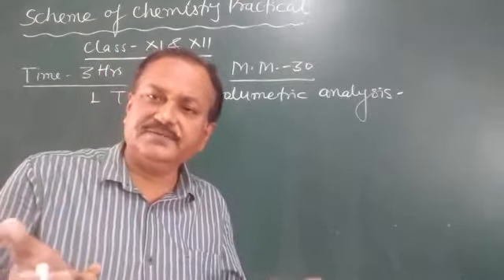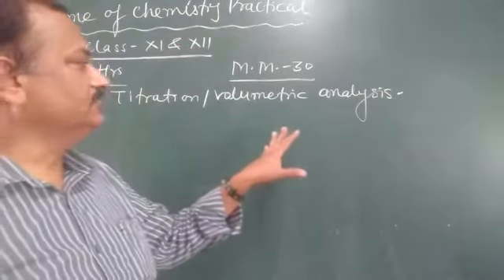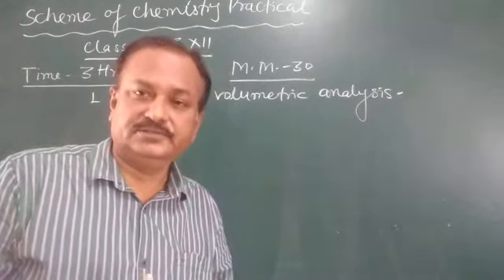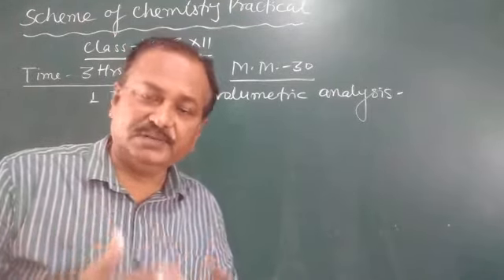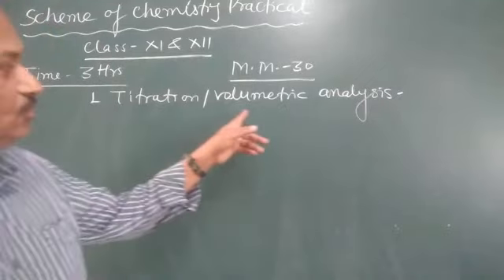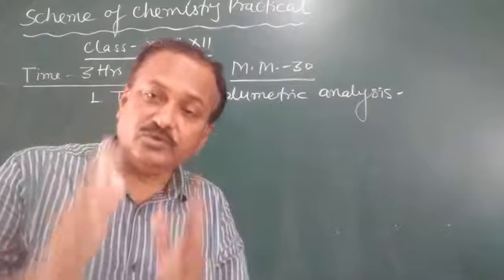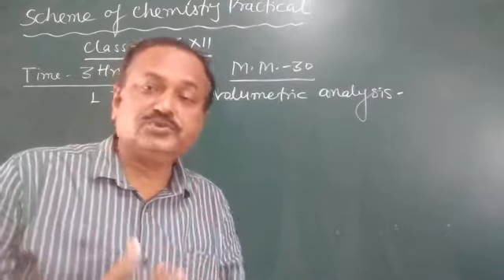Volume is the volume of any liquid, so this involves the volumes of different solutions. You will see later on. Once again I am repeating, titration is also called volumetric analysis because it involves volumes of solutions.